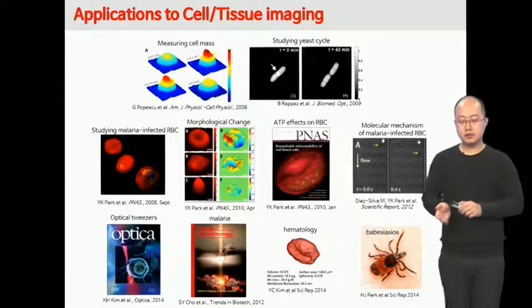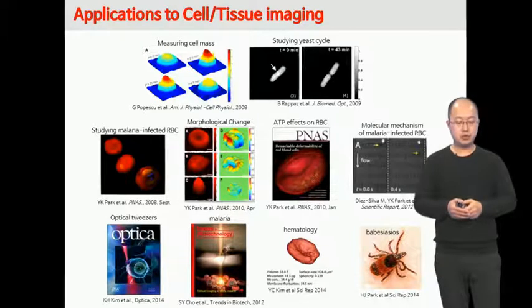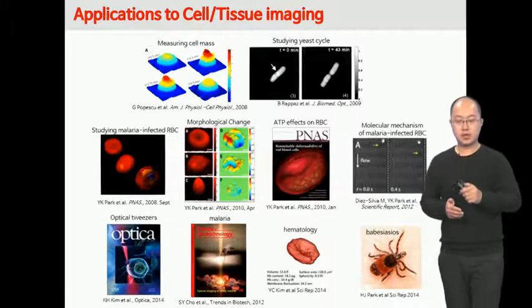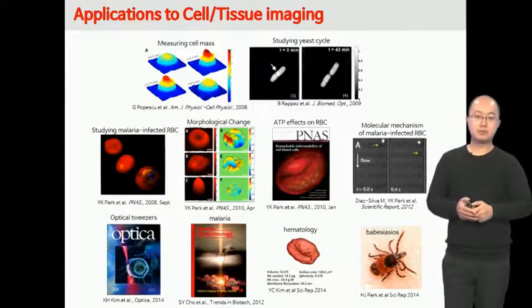In some cases it is very challenging and very inconvenient to employ the exogenous labeling process, but this concept of optical diffraction tomography is very useful for those samples, especially when you do not want to have the labeling process.